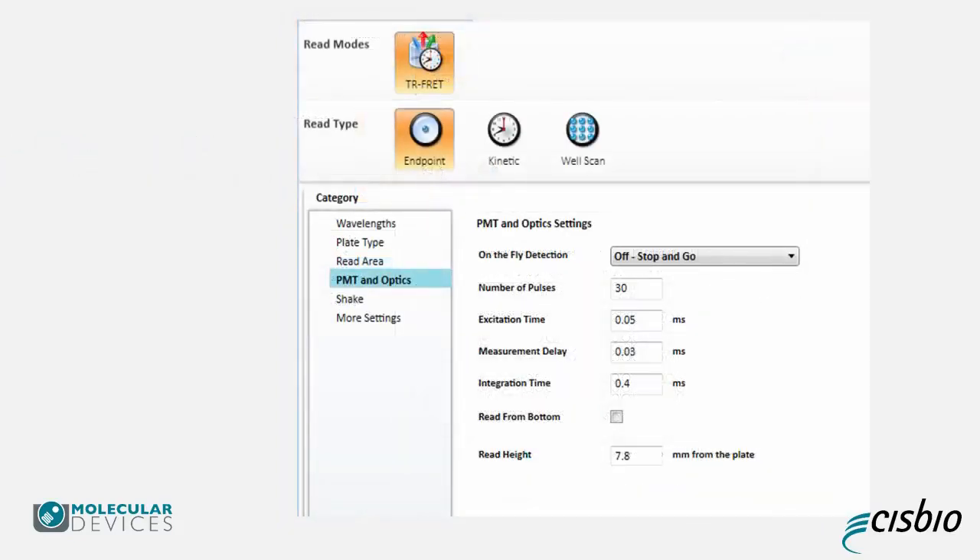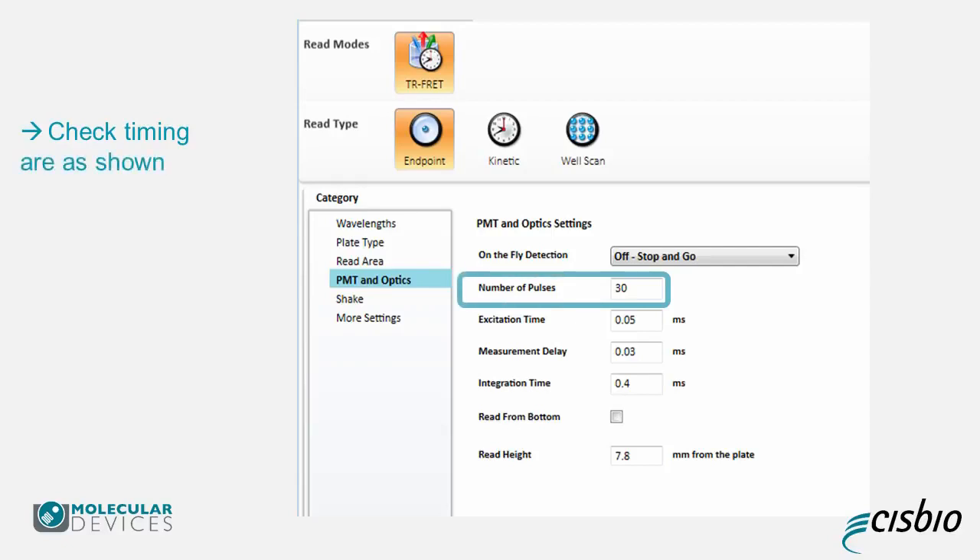On the PMT and Optics screen, check that the pulse number is 30, the excitation time is 0.05 milliseconds, the measurement delay is 0.03 milliseconds, and the integration time is 0.4 milliseconds. Be careful as some software versions may not have the accurate settings.